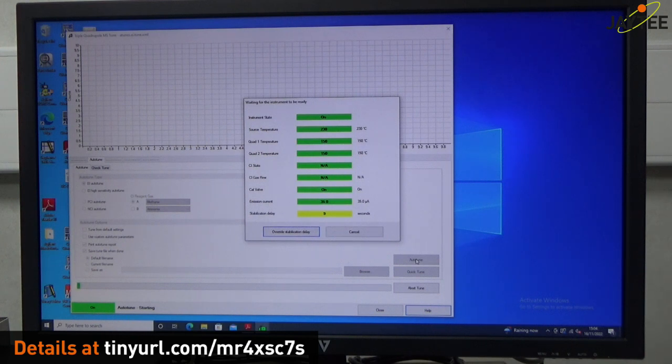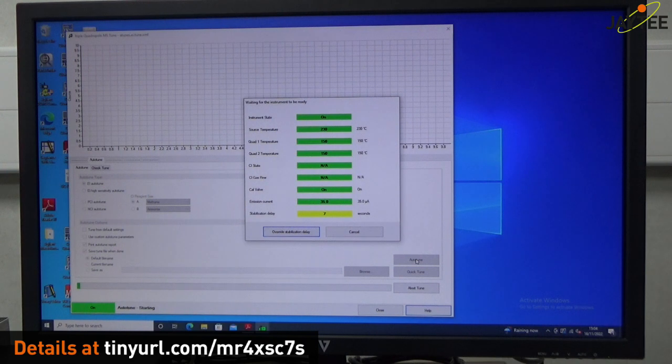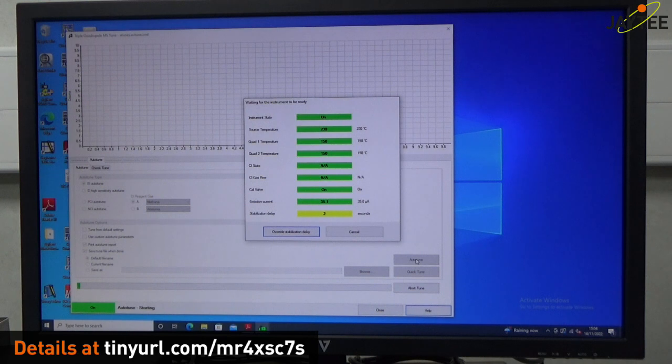Then there's no interference at all from the user. And afterwards, once it's done its tune, we can then do a check tune.